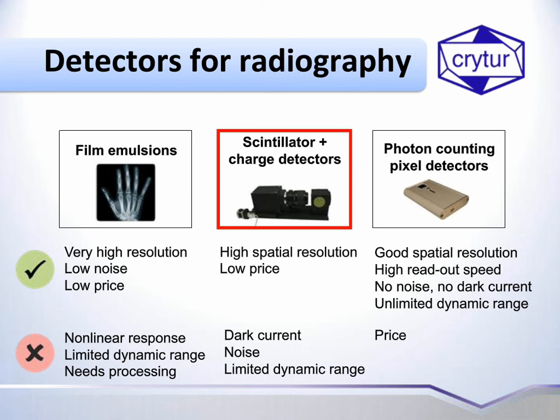And here there's a good spatial resolution, which is lower than with scintillators, but there is no noise, no dark current. But unfortunately, the price is very high for now. So let's move to scintillators.